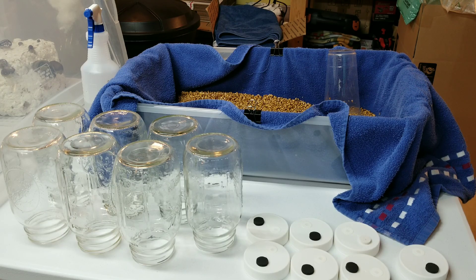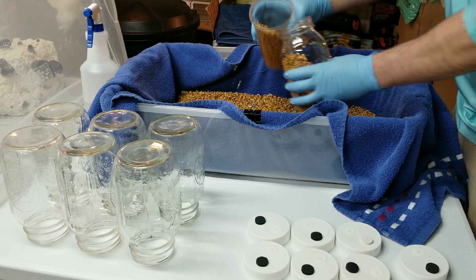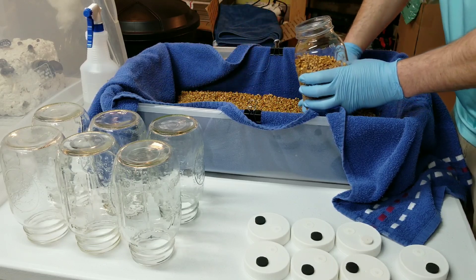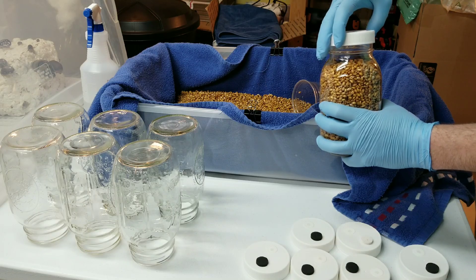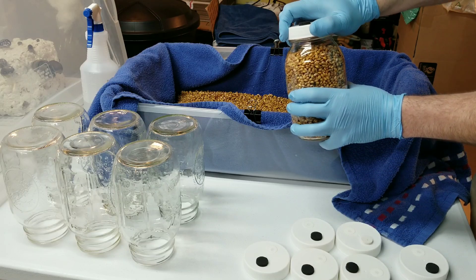I'll show you a close-up of exactly what it looks like in the jars once we've packed them in. We have our lids on - just our standard PP5 plastic lids with our micro pore filter discs and injection ports. Let's fill these jars up. I'll show you some good close-up shots of what your grain should look like before it goes into the pressure cooker. I'm using wheat, which I can get very inexpensively in my area.